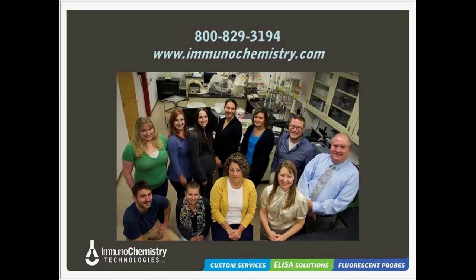Wouldn't it be wonderful if that were the case? Stuff is cheap enough. In fact, the older the non-fat dried milk, the more off-brand it is, the better it works. But unfortunately, polystyrene surfaces have a different structural feature than nitrocellulose or PVDF-type membranes. The basis for the way they operate is that the milk does not stick and block as well to the rigid, less complex polystyrene ELISA well surfaces as it does on these membranes that are made to basically non-specifically bind to protein. So you can't just use that.